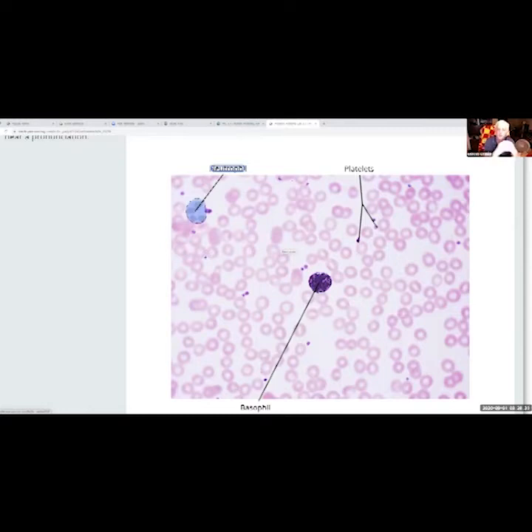Platelets. Platelets are little fragments that break off what's called megakaryocytes. They're these really big cells that just break off these little sections and send them to your body. What happens if the body is traumatized, if there's a cut, if there's an opening in the bloodstream, these platelets adhere to it, and they help with the initial plug to seal the clot. Now, if your body makes too many platelets, it's going to start sealing your arteries, arterioles, which is not good. That's what causes strokes. That's what causes a lot of embolisms, things like that. The platelets stick together. Okay? The platelets are your main defense, your first line of defense against an opening or cut in your bloodstream. They're the ones that clog it or seal it up.